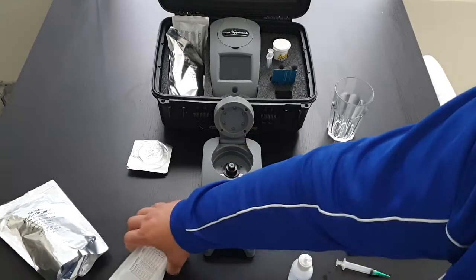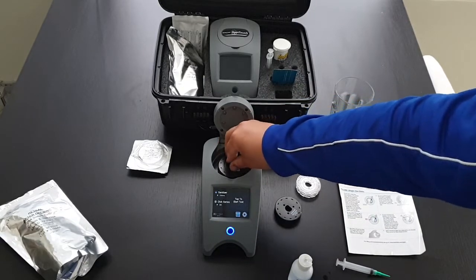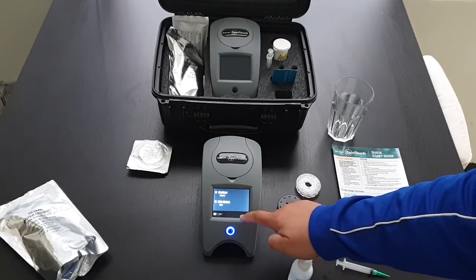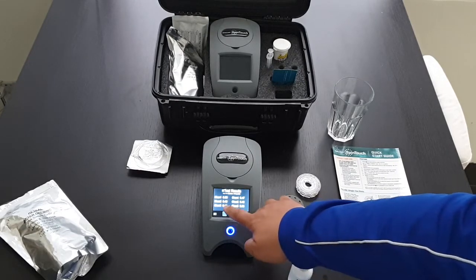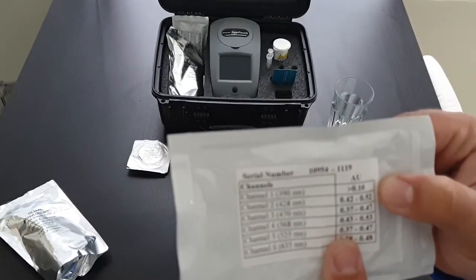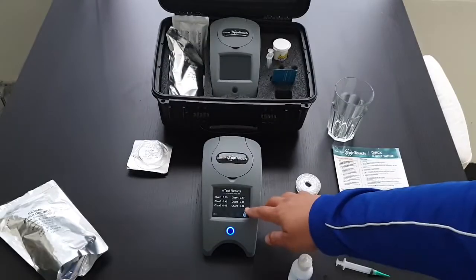To check the calibration, get the meter check disc and insert it — you don't need to put a cover on top. Select MCD, which is the meter check disc, then tap to start. This is checking the calibration of the unit. These are the different channels — for the first one we need to have above 0.10, and we've got 0.5. The rest are all within the required ranges.